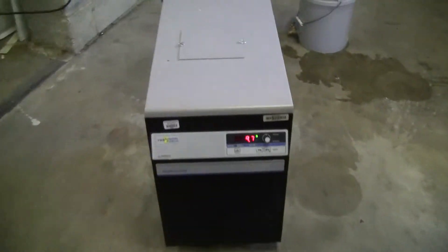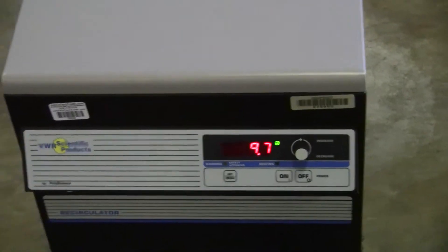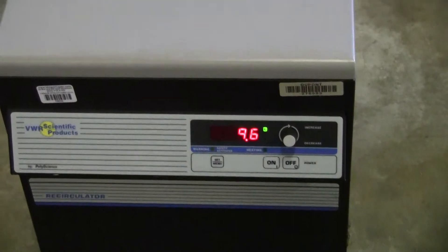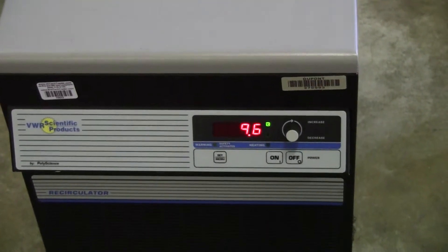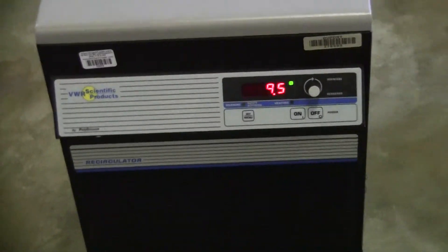You can hear the compressor is on right now. Our set point is at 6 degrees right now, we're sitting at 9.7 degrees C. You can see that the unit is chilling — down to 9.5 degrees.